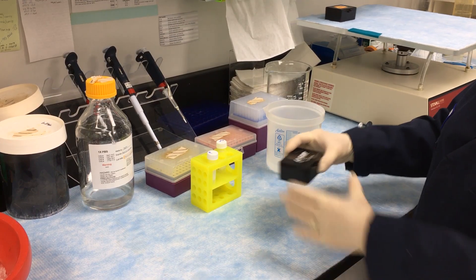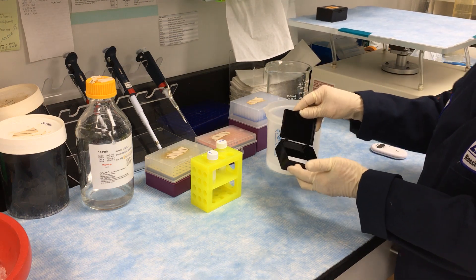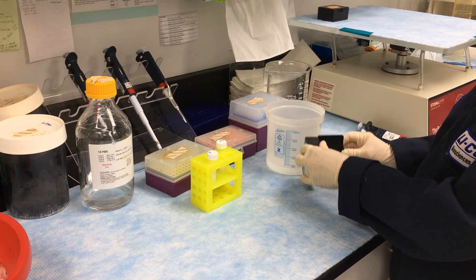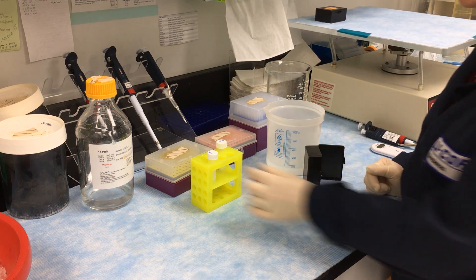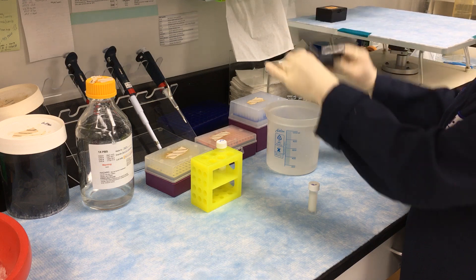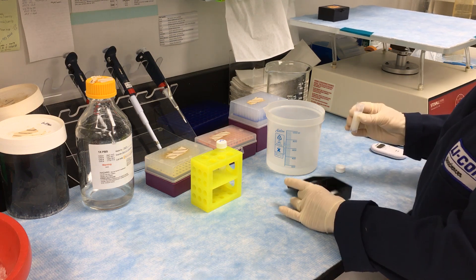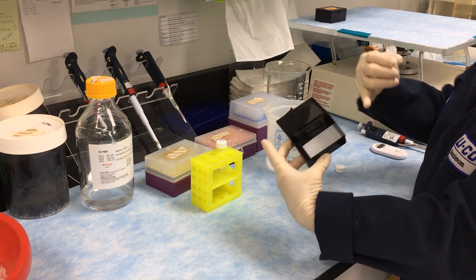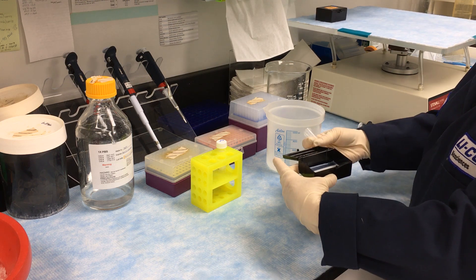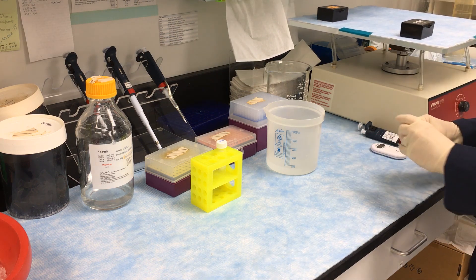Once the blocking step is over, we'll just pour off the blocker. We don't need to wash it out because the only difference between the primary antibody solution and the blocker is the added detergent and the antibody. I'm going to stand this up, allow the excess blocker to come off, mix up the primary antibody really well, pour off any remaining blocker, then pour the antibody in off to the edge so I don't pour it directly onto the membrane. I'm using five mils for this size of membrane, and then we're going to let that go for another hour at room temperature with gentle shaking.